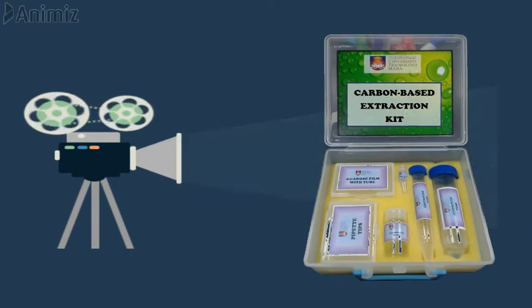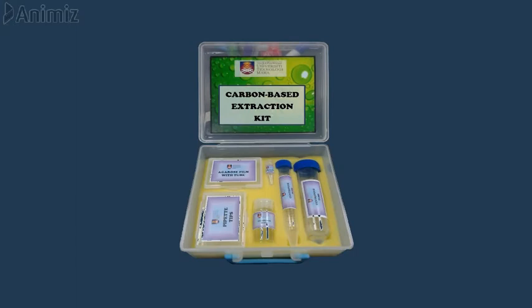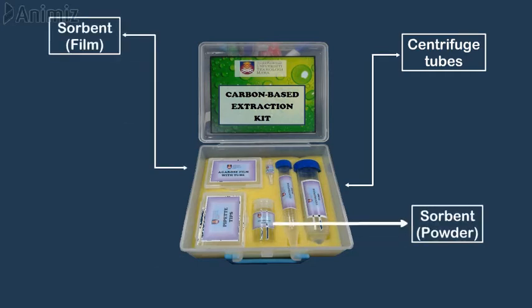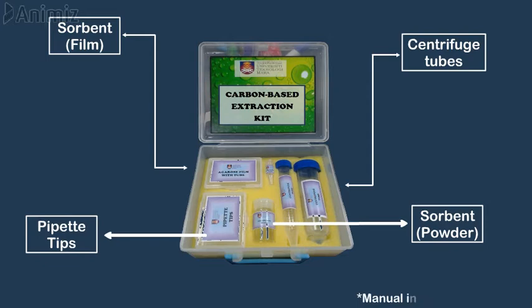Due to their efficiency in extracting analytes and being easy to incorporate with other potential materials, we invented this carbon-based extraction kit. The carbon-based extraction kit comprises centrifuge tubes in various sizes with carbon-based extraction sorbent in the form of film or powder to facilitate the process of extraction at the sampling site.